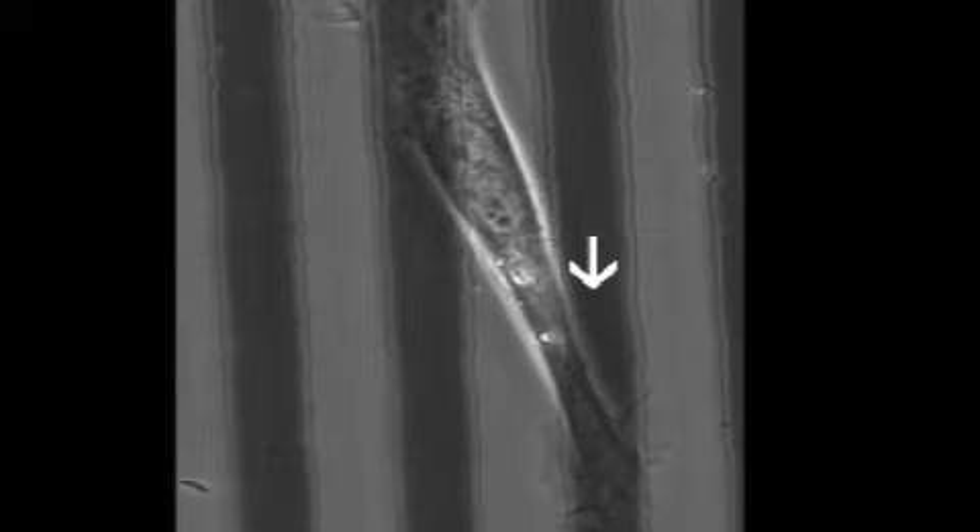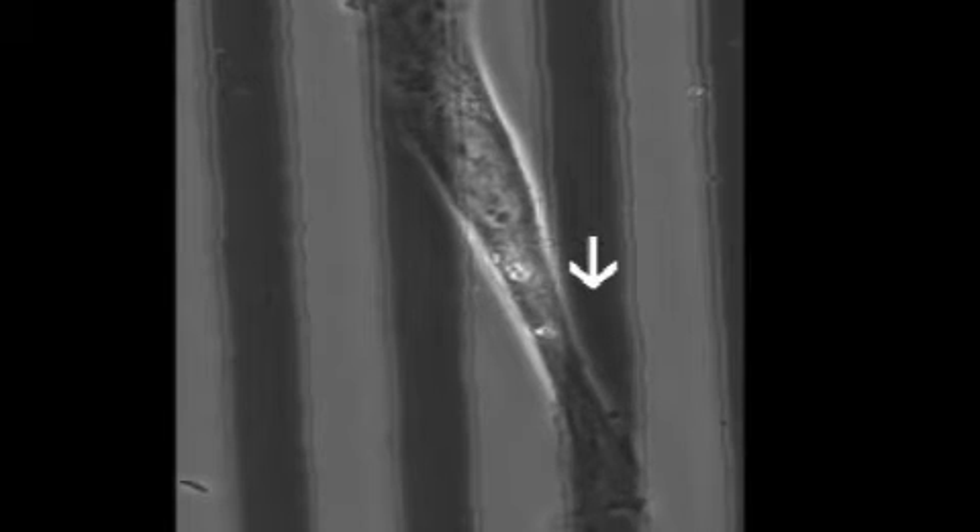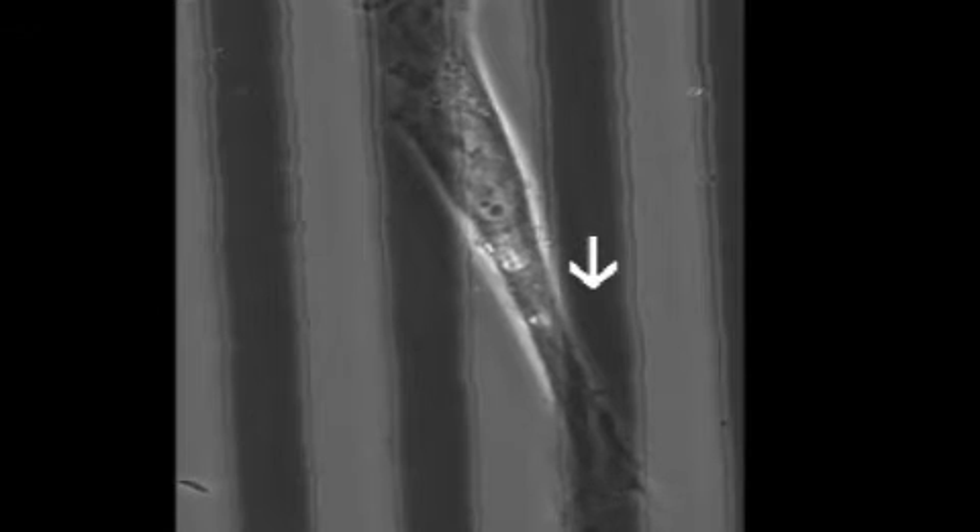When I start it, the electrochemical desorption is initiated — the release of these molecules. At first you see that not much is happening, just a little membrane ruffling, and then you see it start to pull and it contracts.